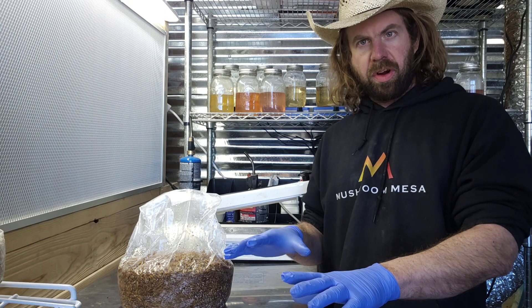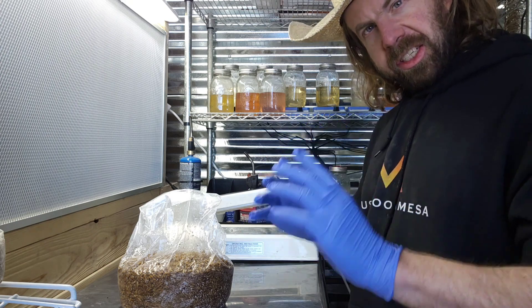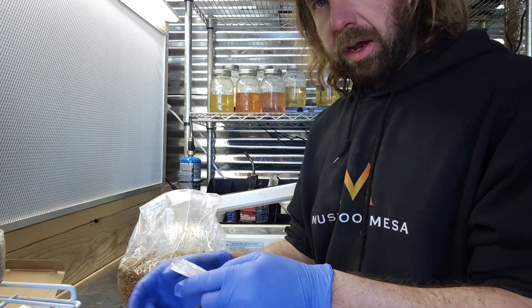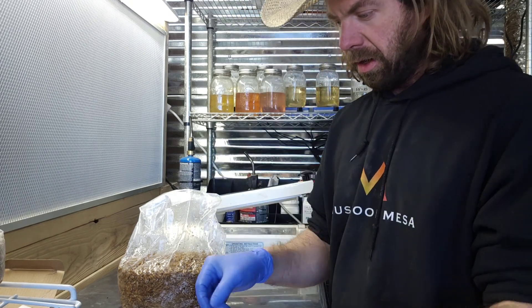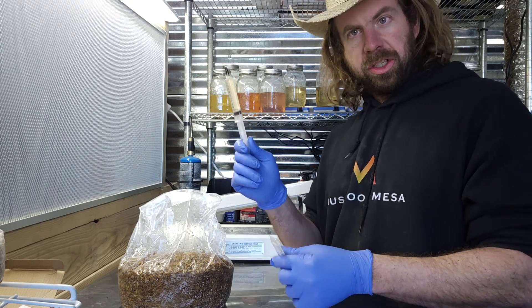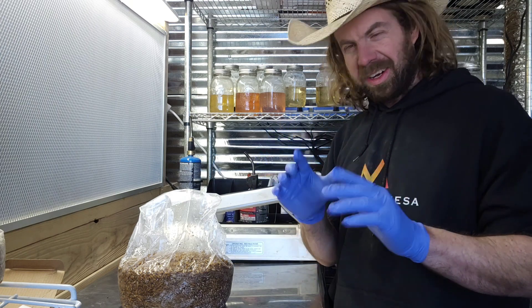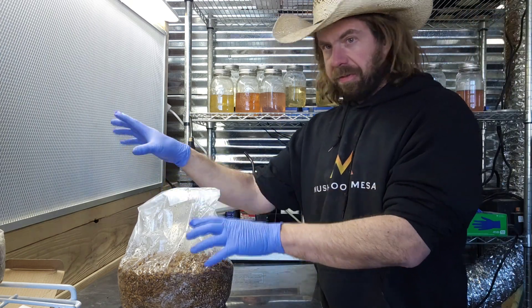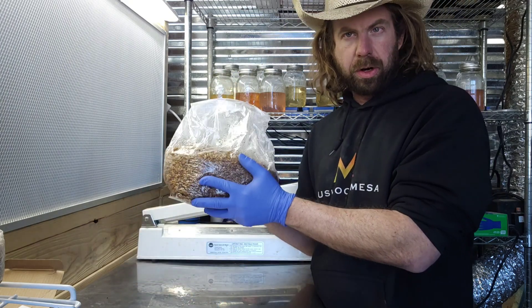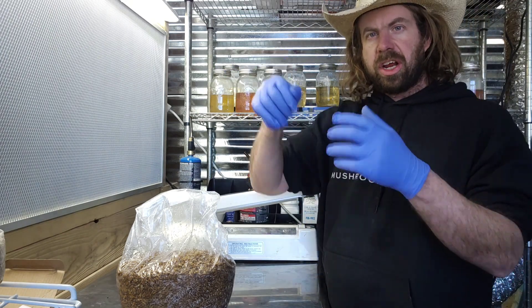I've got all different strains here and I just want to get them all in the grain and get some mycelium running. My basic procedure: I'll take a needle out of the pack, uncap the syringe, put the new needle on, flame sterilize it just to be sure we're completely sterile, open up the bag in front of my flow hood, inject the entire syringe into the bag, then seal and shake.